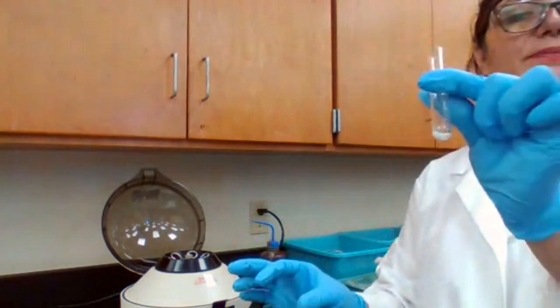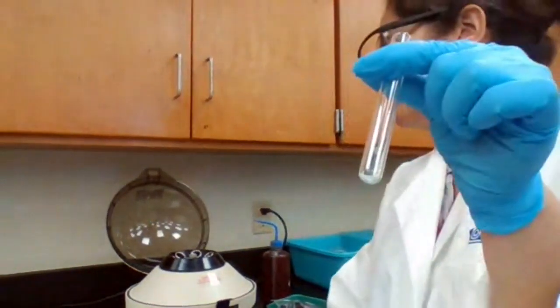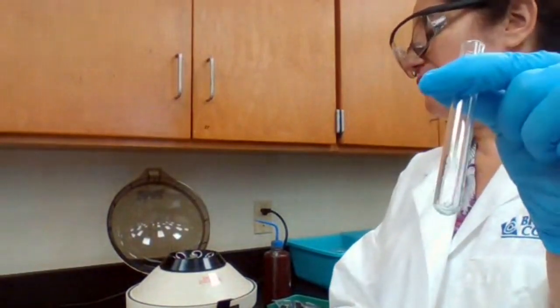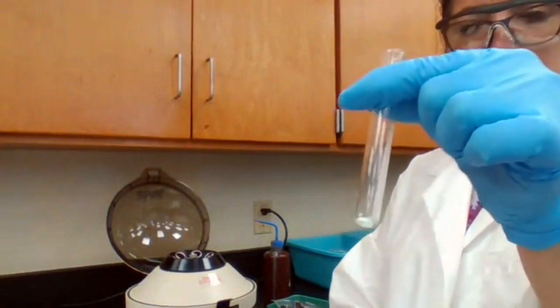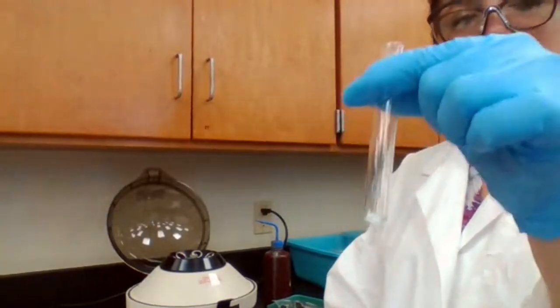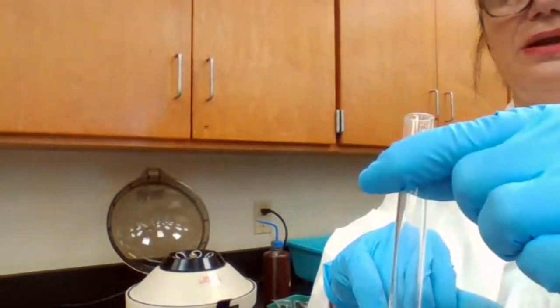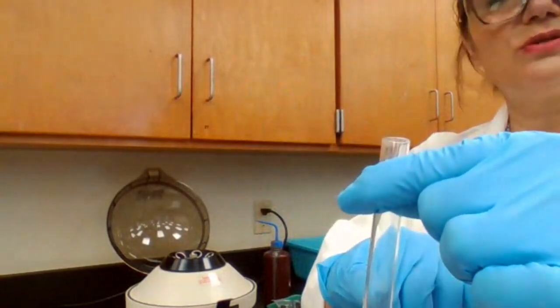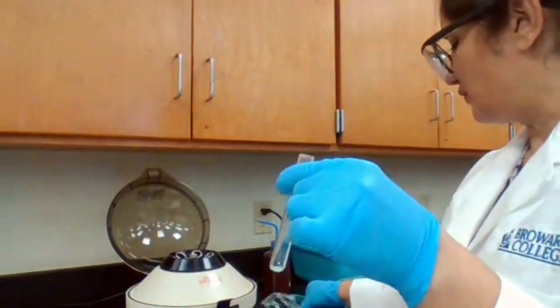The test tube with the precipitate is going to be tested for part B, which is separation of lead chloride from silver chloride. And hopefully you know it already, how to separate lead chloride from silver chloride. Both of them are solid at room temperature, but when you add hot water, lead chloride goes into solution, silver chloride would stay in the precipitate form.